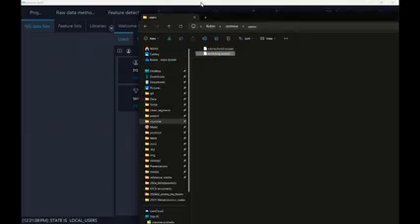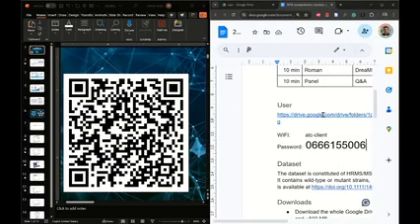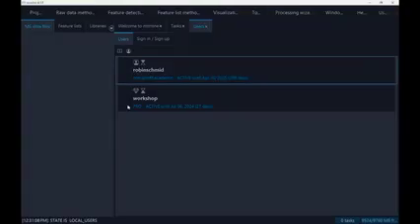Okay, so this is another thing you can do. Just from here, download the user file, and then just drag and drop the file into MZmine, and you should be all good to go. In the end, you should see that in the users, now you have a user that's actually selected and that you can start processing.